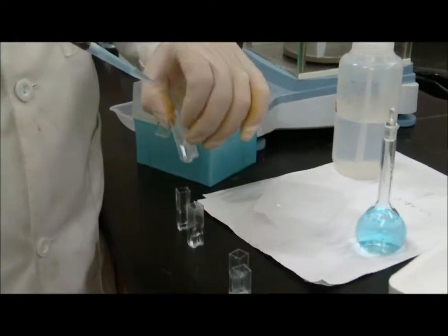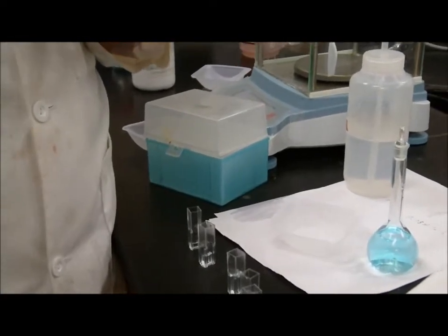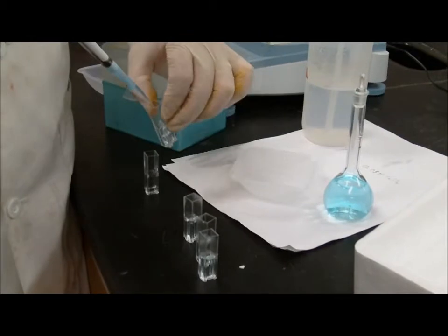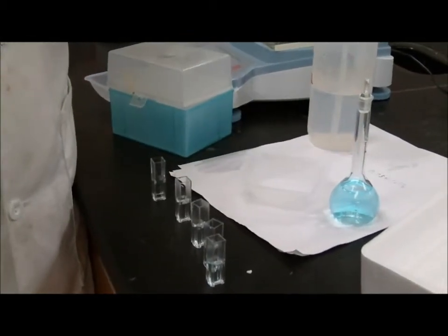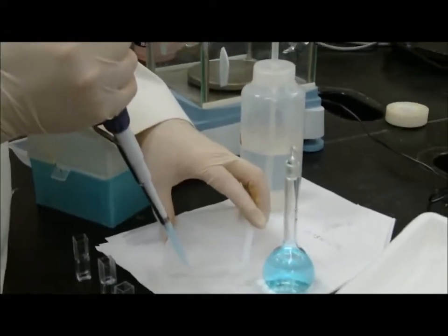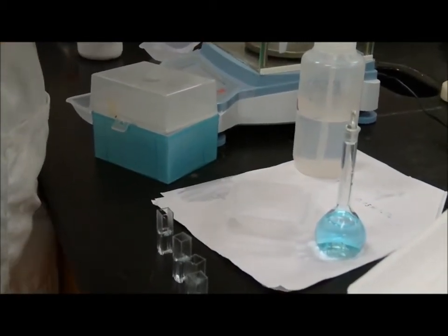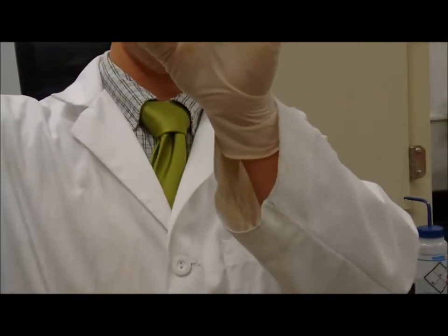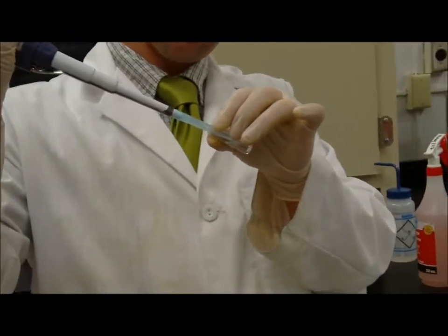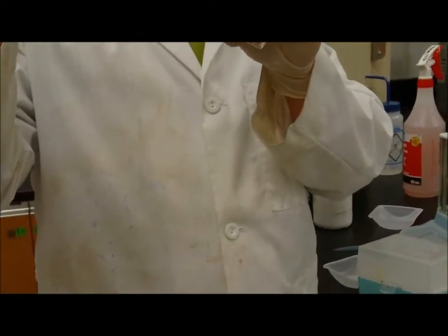So I just did my 80%, now I'm doing my 60%. To my 40%, I need to add 0.6 milliliters of water. And to my 20%, I need to add 0.8 milliliters of water. Okay, now this is my 20%, I gotta give it a good mix. I have to be sure it was well mixed. This is only 20%, so it's not gonna influence the concentration of this one very much. It would be best to change tips every time, but it's kind of wasteful, and I can see that I'm not getting crossover too much.